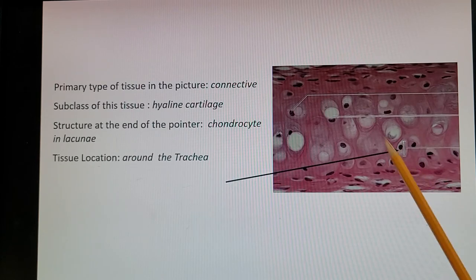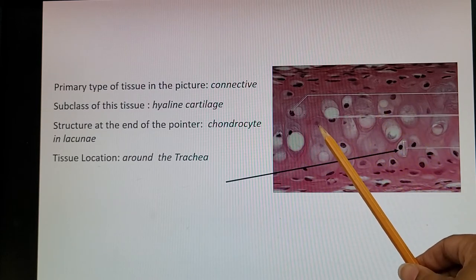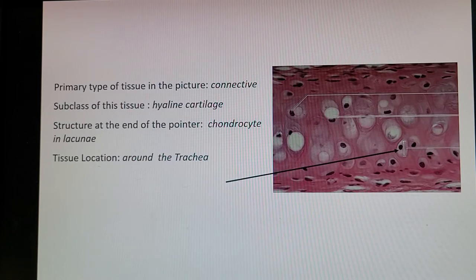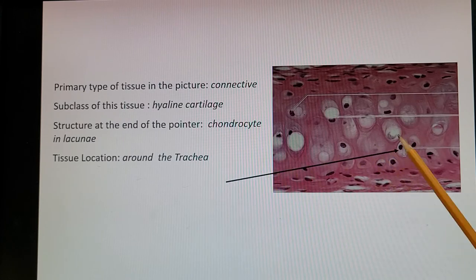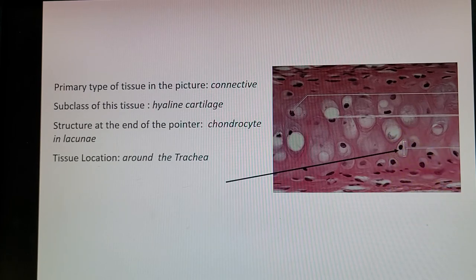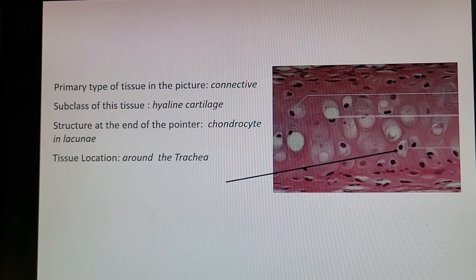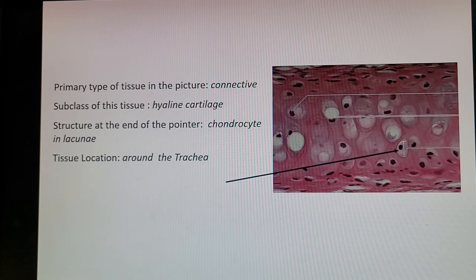Here is another connective tissue — hyaline cartilage — which has a more glassy, clear appearance; you can actually see through it and even see nuclei through layers of collagen fibers. The structure at the end of the pointer is a chondrocyte in a lacunae. Chondroblasts build tissue around themselves until they become trapped in that little lacunae 'cave,' becoming chondrocytes. The location is around the trachea — you may have seen those cartilage rings in a mink dissection.